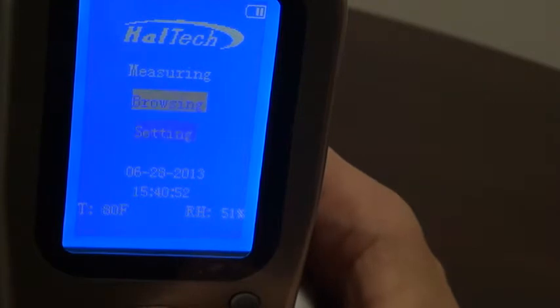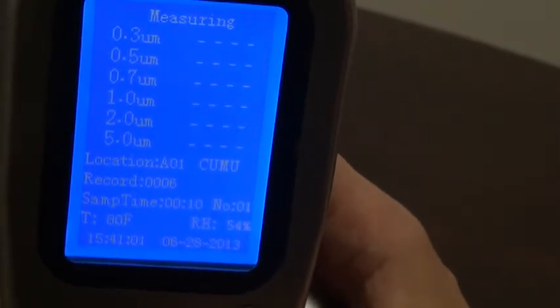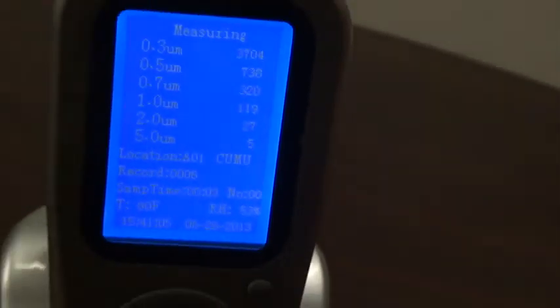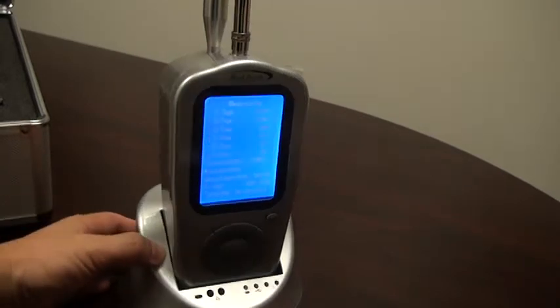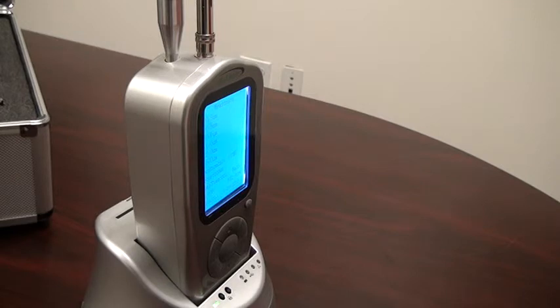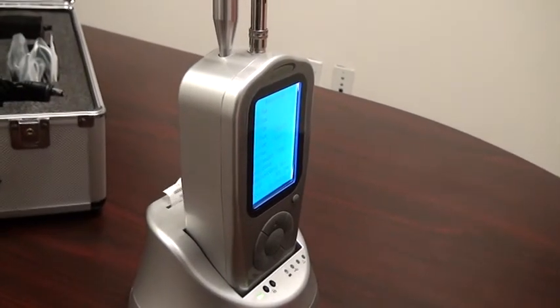We move up to the measuring screen and we can acquire data at this point. When the unit is not in use, the cap should be placed over the sensing port to protect the handset.